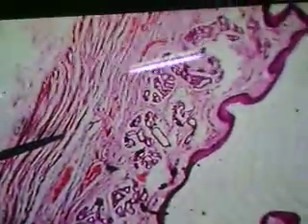A slide of the pharynx and larynx. So we come back here. This back here would be the laryngopharynx. This is the laryngopharynx that we're looking at back here. And there we see the inferior constrictor: the cricopharyngeus and thyropharyngeus. That would be the inferior constrictor right here.